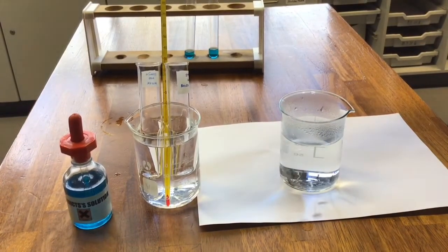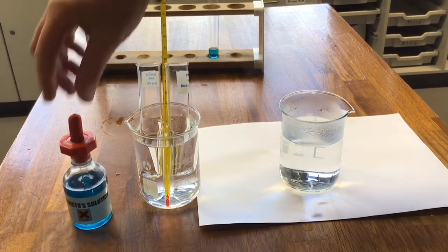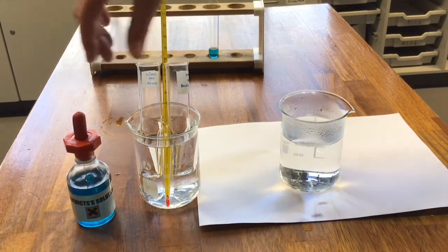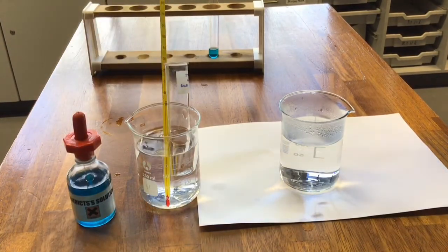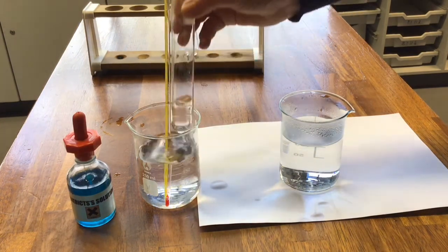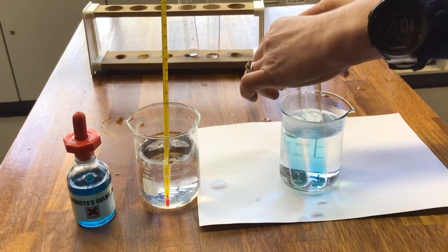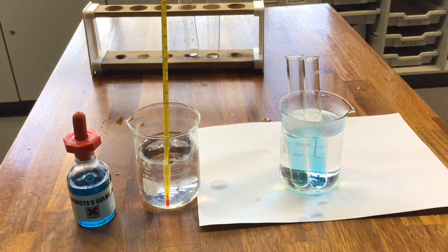After 10 minutes, we remove our mixture, and to see if the starch has got broken down to sugar, we test using Benedict's solution, and we add the contents of the test tubes to the Benedict's and place it in a hot water bath. So we heat the mixture up. If the saliva still has active enzymes, then the starch will get broken down to sugar. So we place it in a hot water bath and we watch to see the colour.